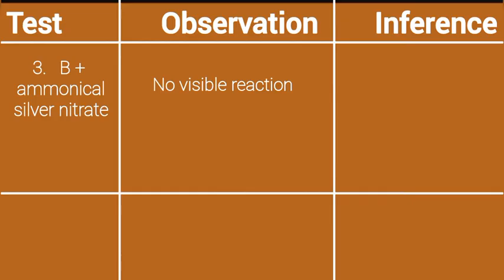And that is why under the inference, I would have to write alkyne, which is pentyne, absent.